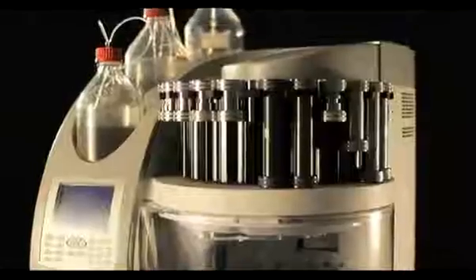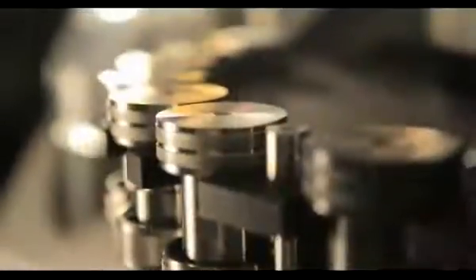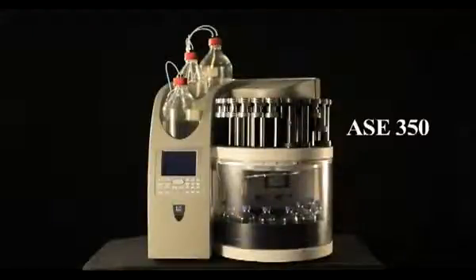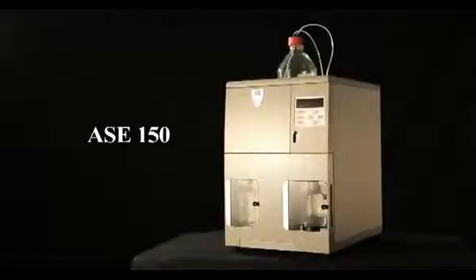Whatever industry you're in, you can enjoy the benefits of accelerated solvent extraction with ASE systems from Dionics, the fully automated ASE 350 for the busy lab with lots of samples, or the ASE 150 for single samples.